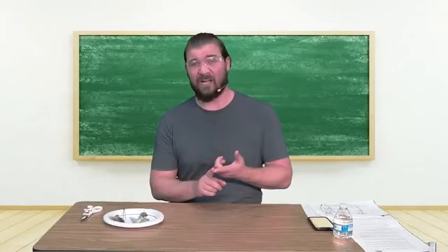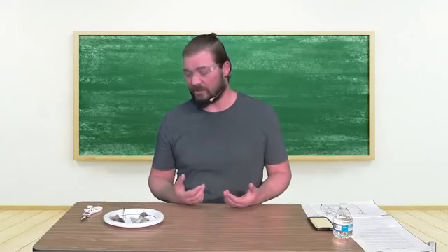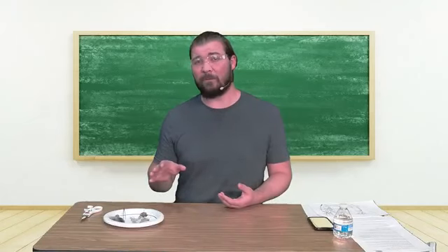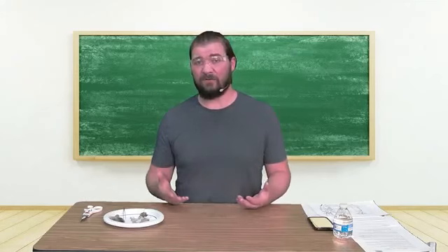So I can change my color, and I've got my ink sac. Also, they're fantastic hunters, and that helps them find food.